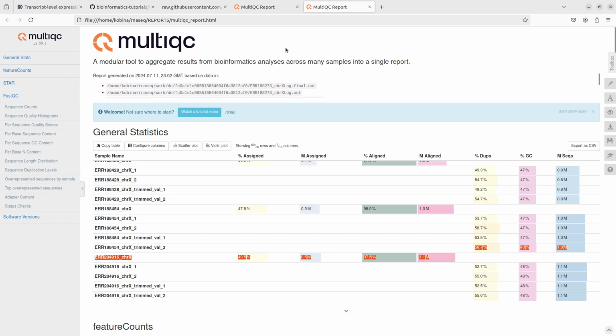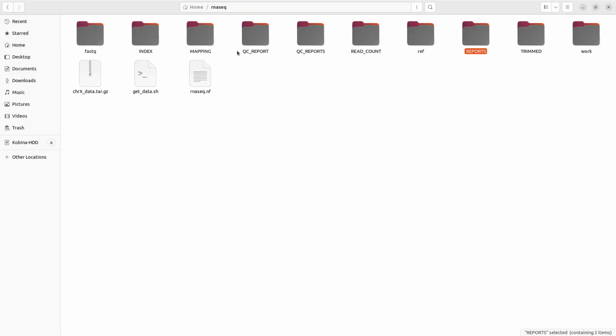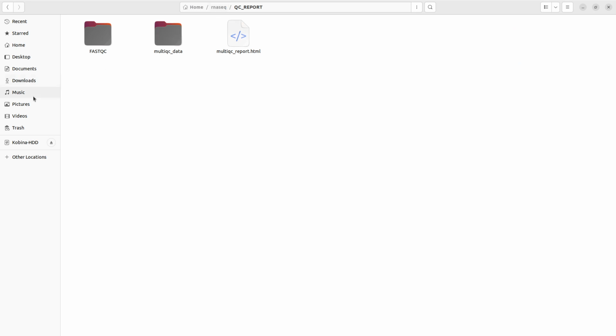So this is it for the MultiQC reports. We also have this report, which is for FastQC only. I place that here, so I will call it QC reports. So I'll just go over again.